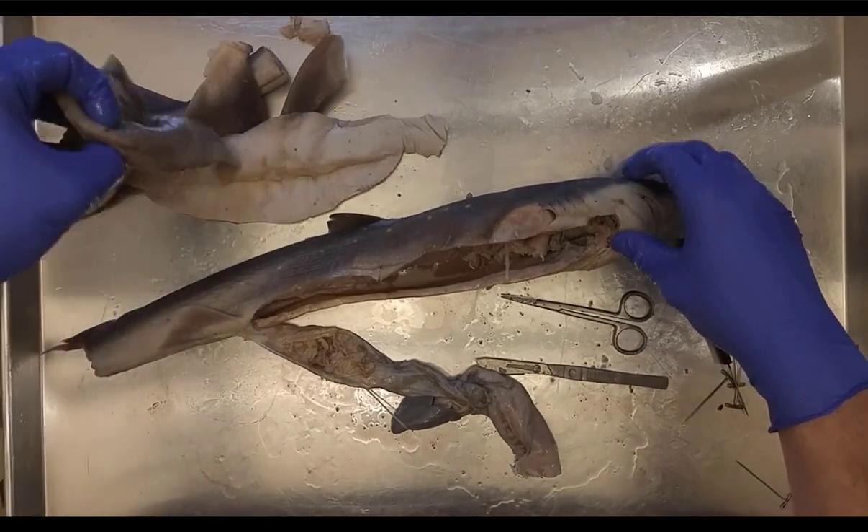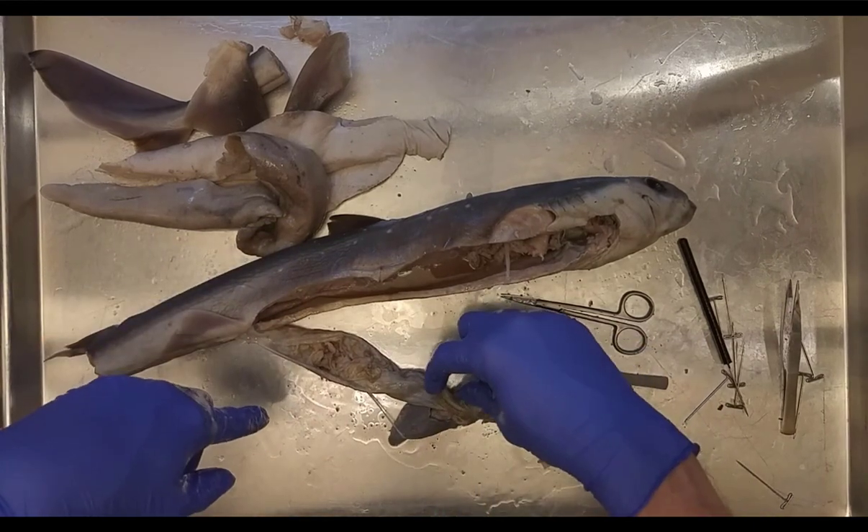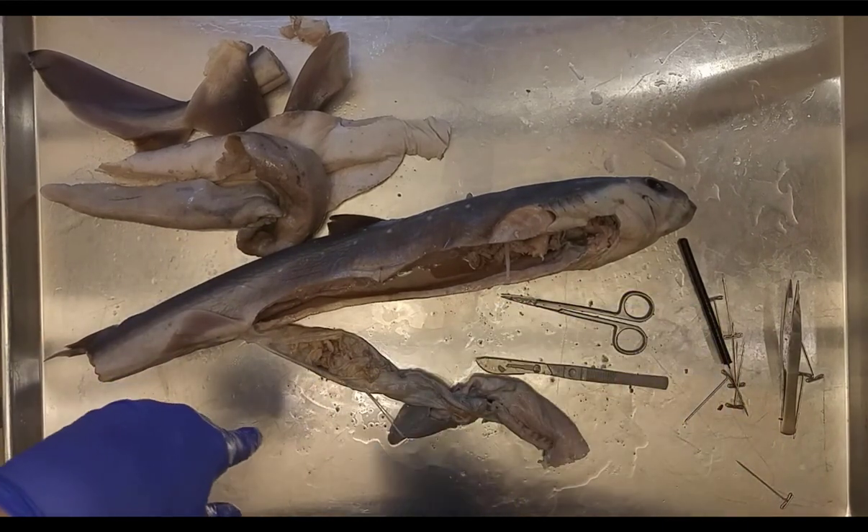To summarize the internal structures: liver, heart, stomach, spleen, duodenum, ileum with spiral valve, and rugae.